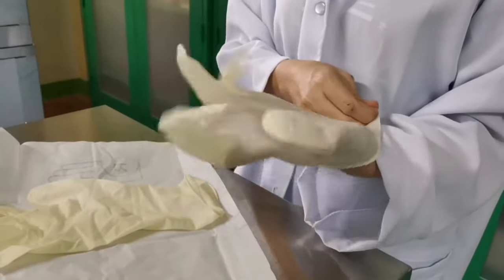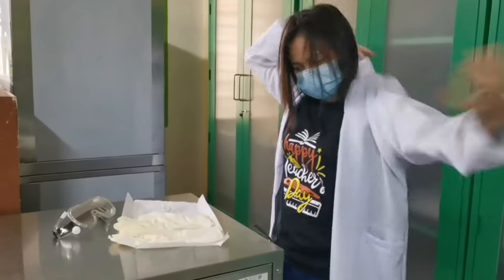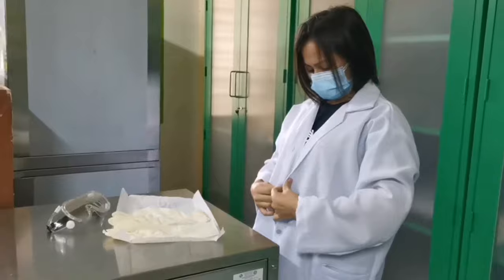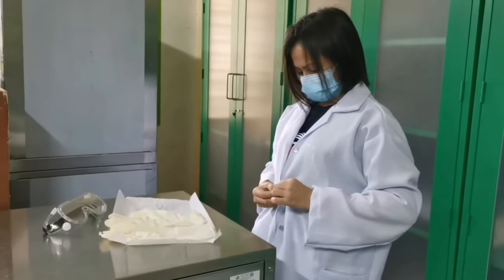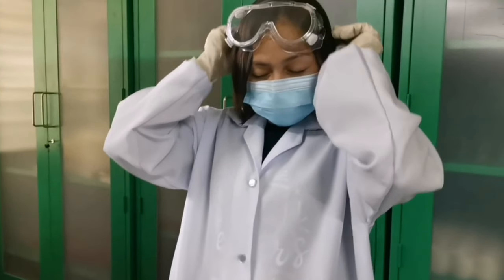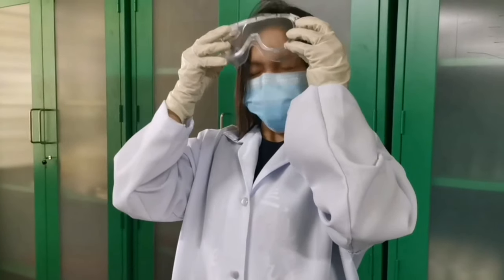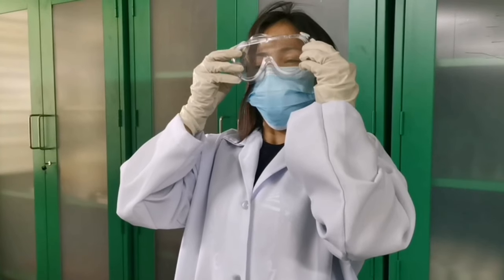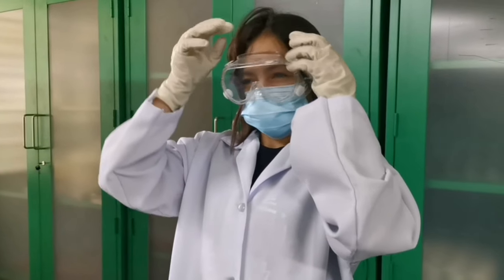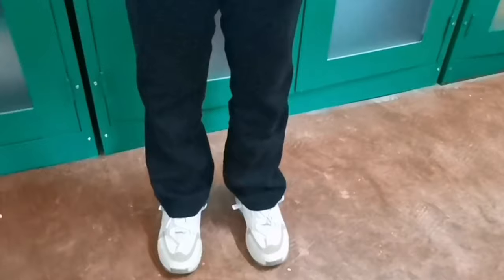Avoid skin contact with all the chemicals by using hand gloves. It is also highly recommended to have a lab coat to protect your clothing and, more importantly, protect your skin. You should also wear safety goggles or a face shield when performing any test where there is potential danger to the eyes. Wearing safety goggles is a must and must be worn at the lab at all times. Shoes that cover the top of your feet are very important also. This goes for the boys and girls.